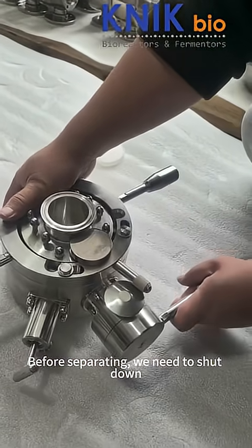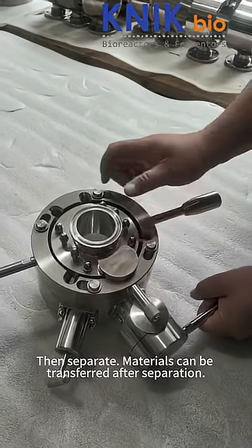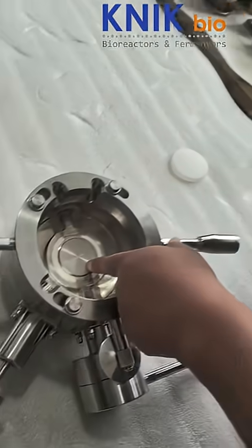Before separating, we need to shut down. After closing, both the upper and lower valves will be sealed. Then separate. Materials can be transferred after separation. The transfer side is also sealed.